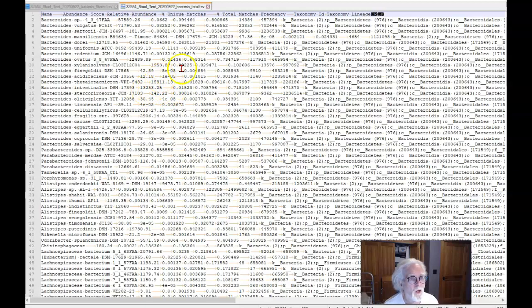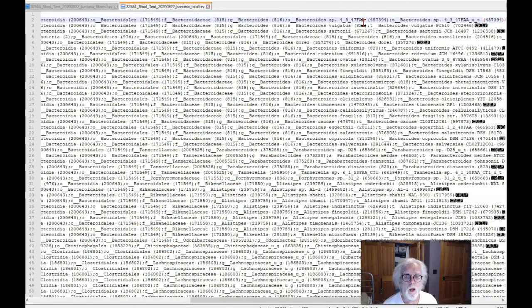And from this information, for example, the taxonomy ID, which is way over on the right side, we also can see the name right there, and from that we can use that for a nice easy import. Okay, so that's basically it.